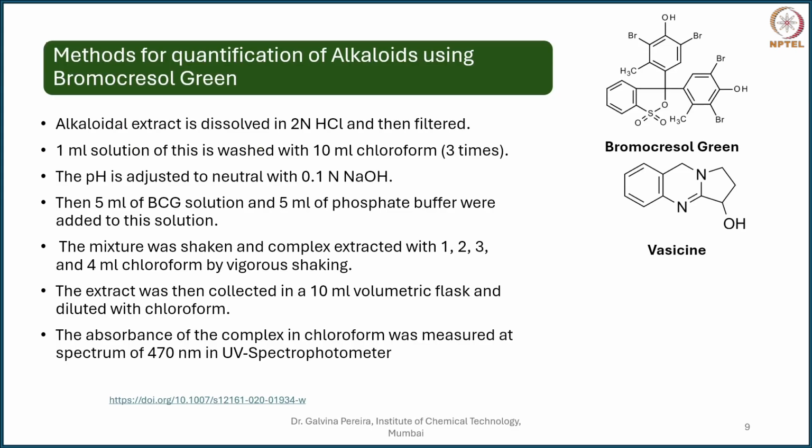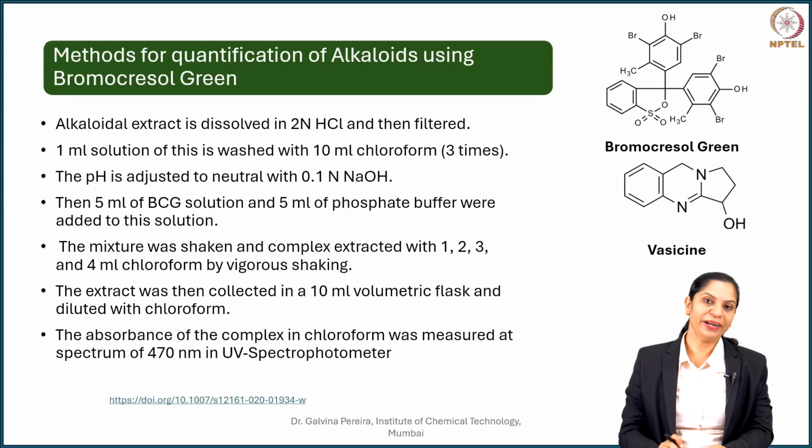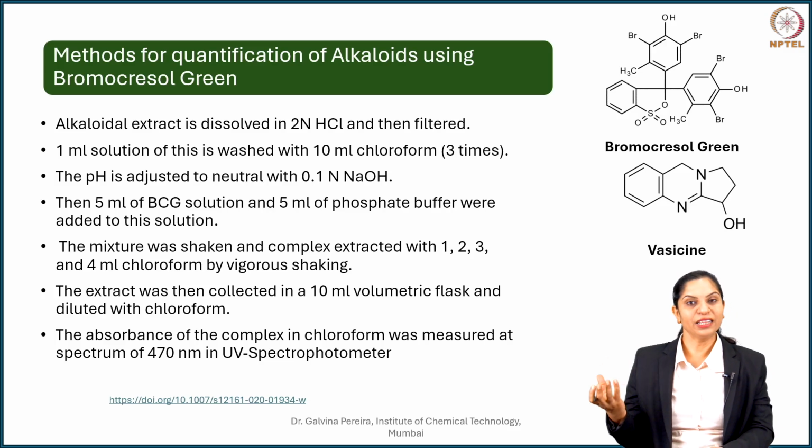And you can see here, even in this case, you do an alkaloidal extraction. How do you do alkaloidal extraction? Depending upon the stability of alkaloids. Now generally alkaloids are very stable, so you take the plant drug, pulverize it very fine. Generally sometimes this can be done with a ball mill, with an ultrasound, or if you don't have, you can use a mixer grinder, but ensure that you don't overheat and char your powder.